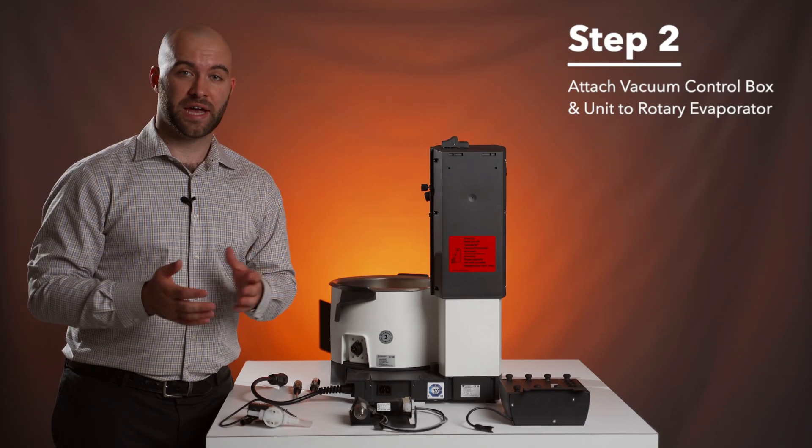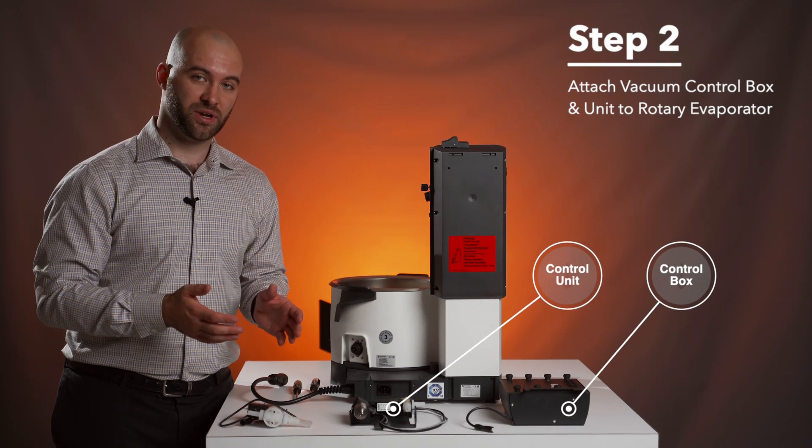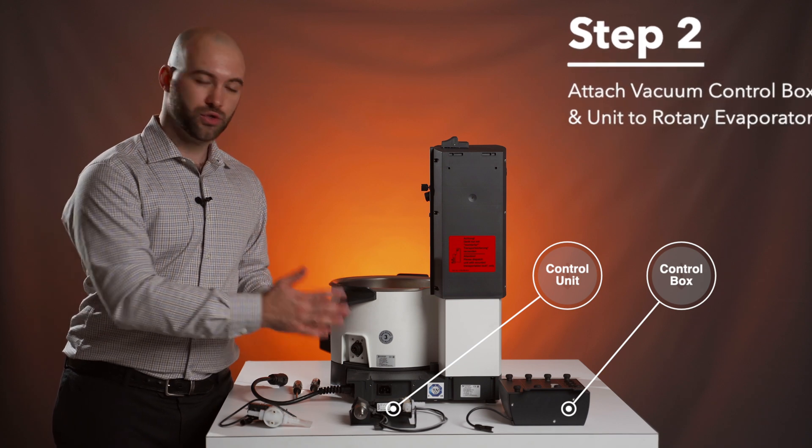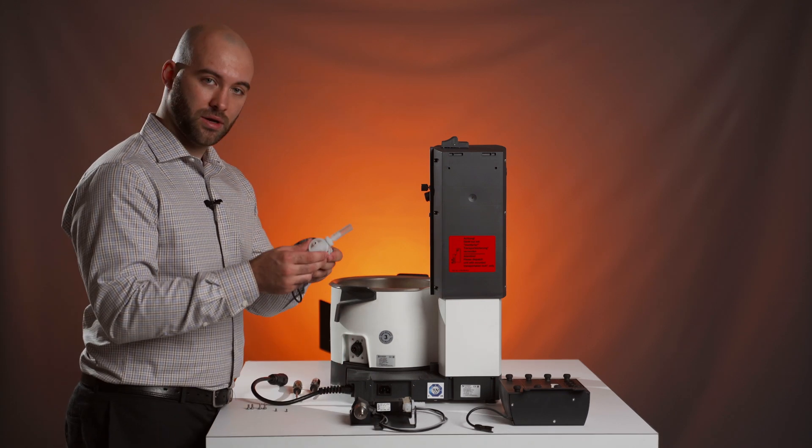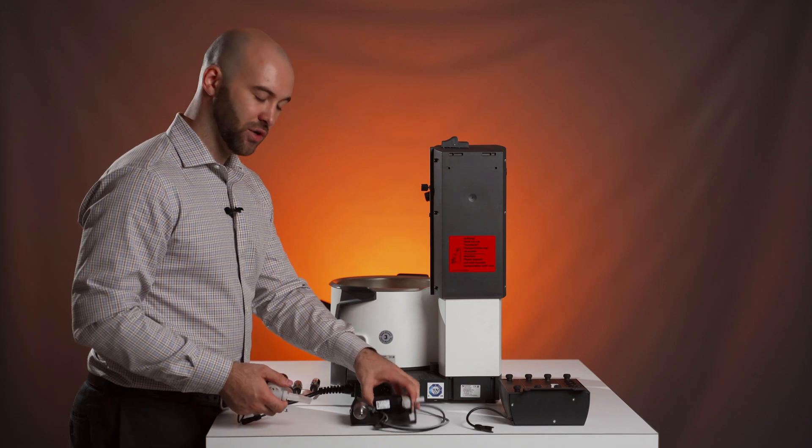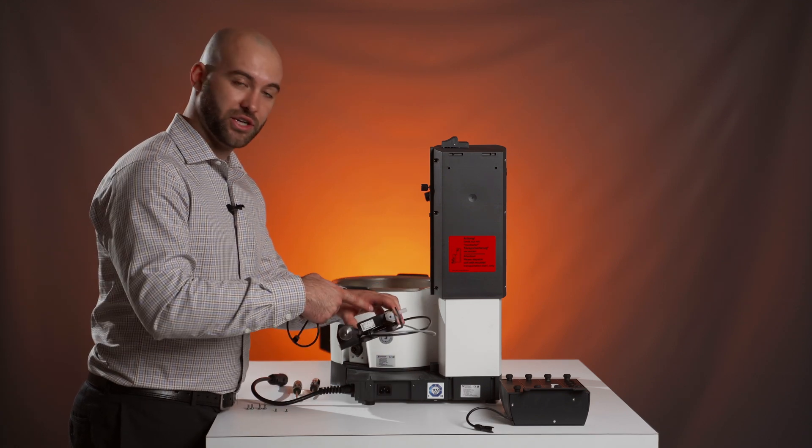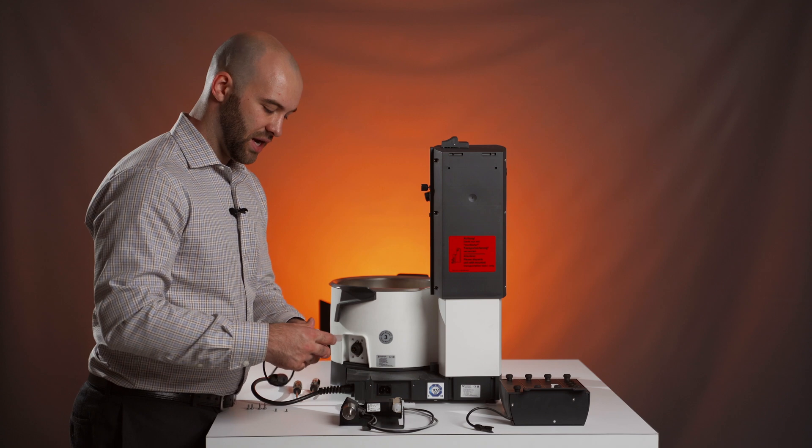Step two, we're going to attach your vacuum control box, your vacuum control unit, and your vacuum valve to your rotary evaporator. First, I'm going to take the vacuum valve and your vacuum controlling unit, which includes your vacuum sensor and your relief valve, and connect them.